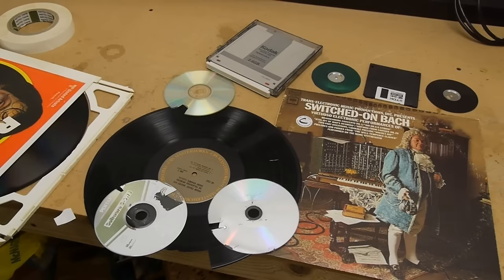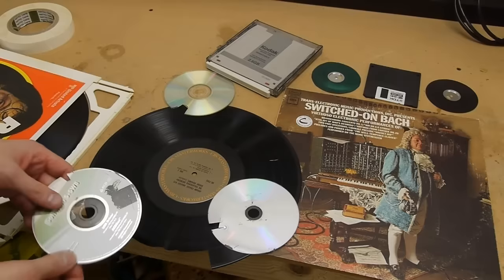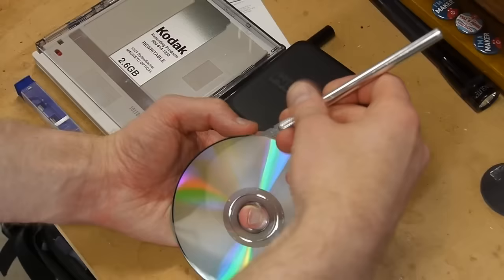Of course I also wanted to take a look at a DVD. Unlike a CD-ROM that has the aluminum layer and a protective lacquer on one side, the DVD is built sort of like a sandwich where it's got polycarbonate discs on the top and the bottom, and the aluminum information layer is in the middle.